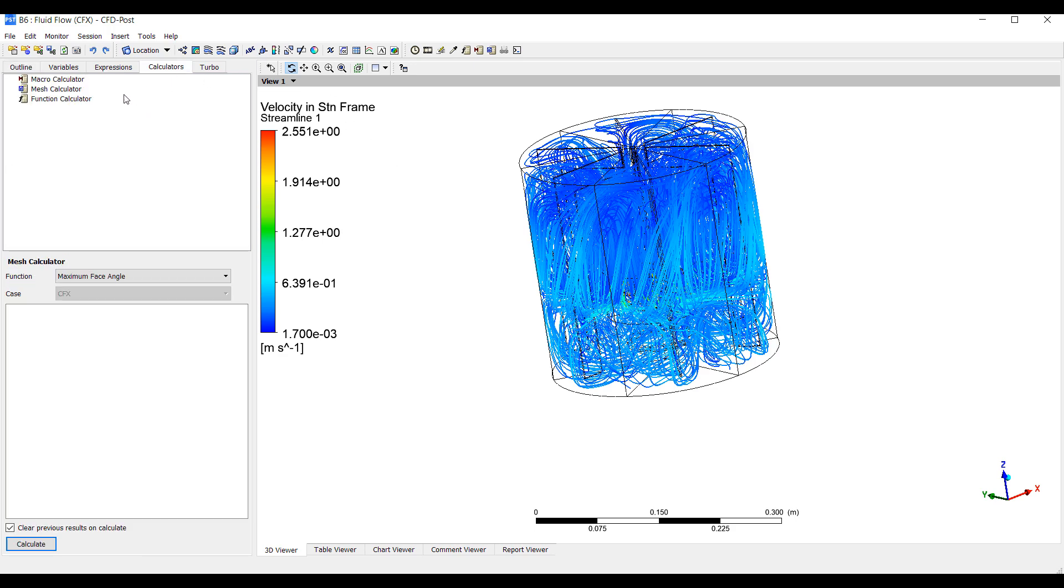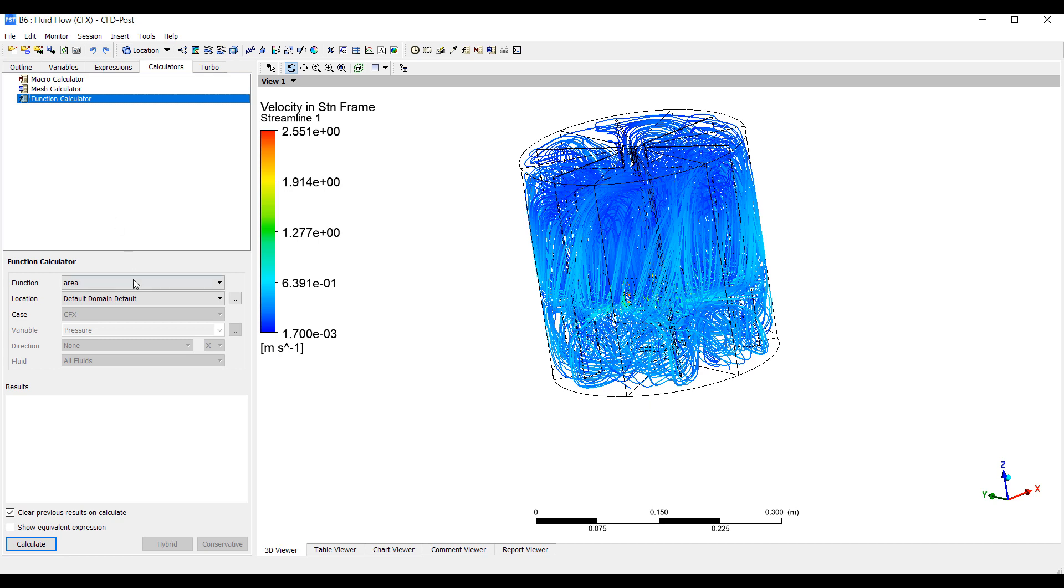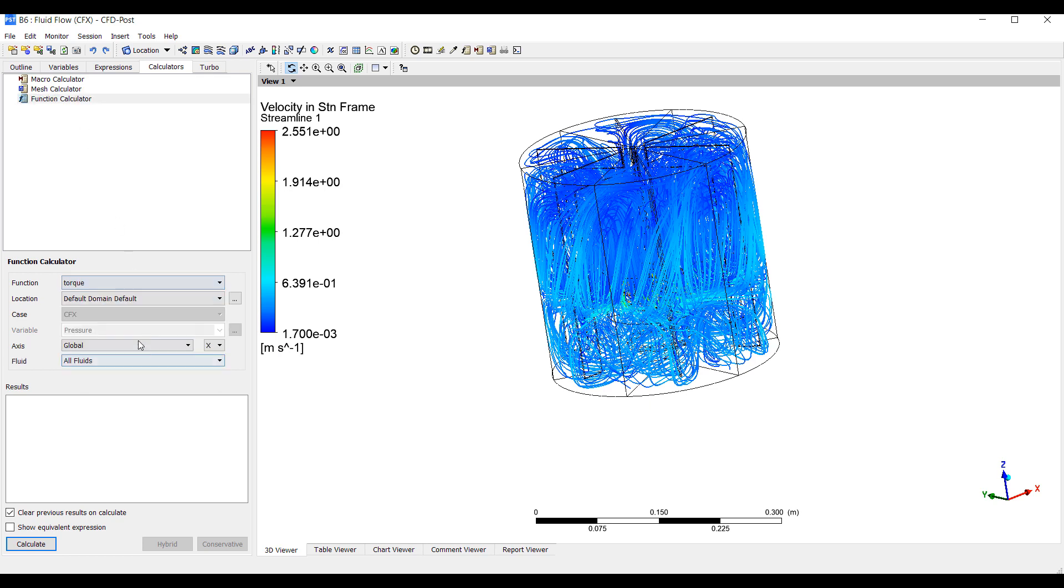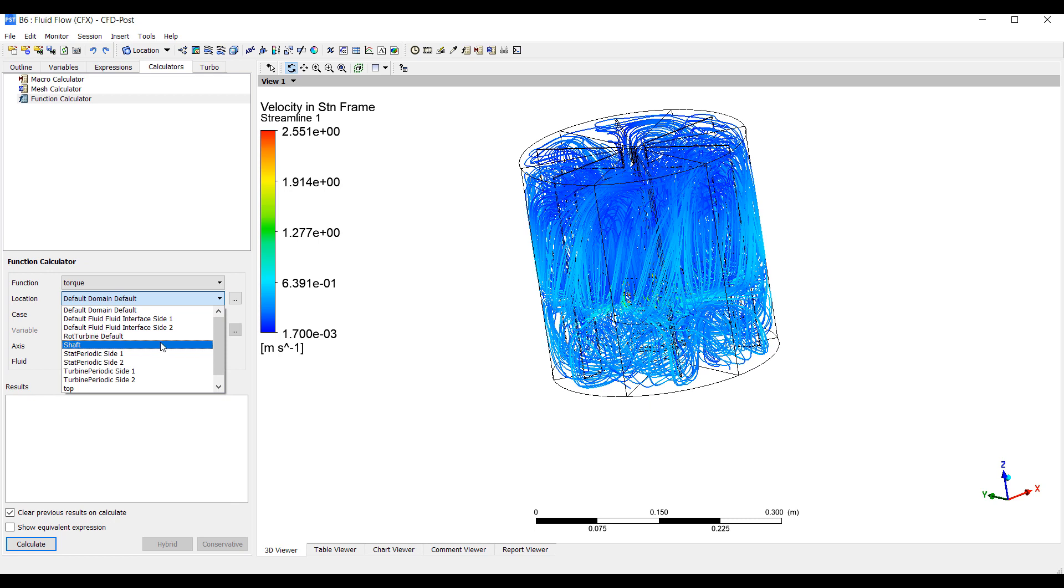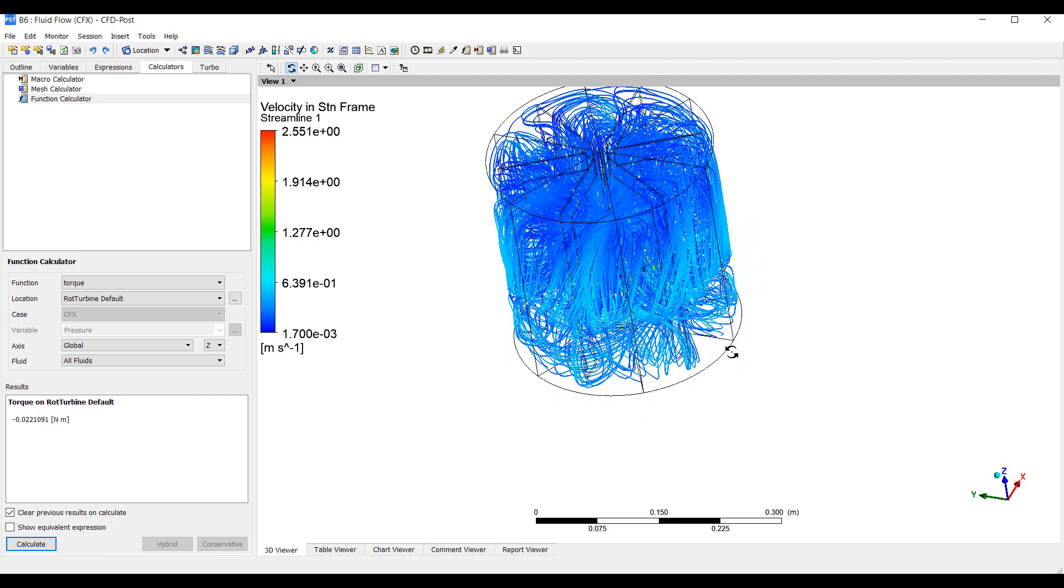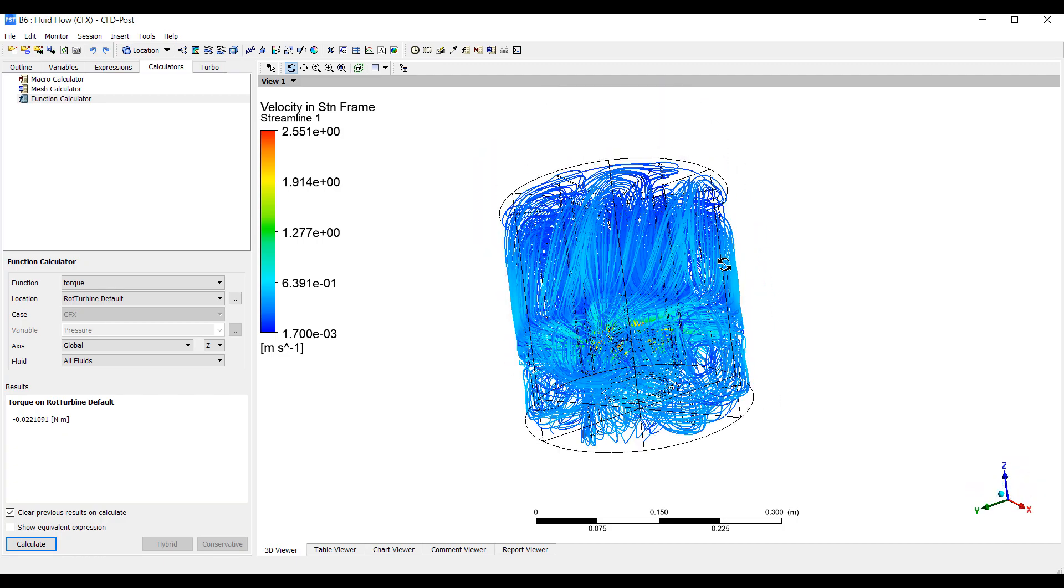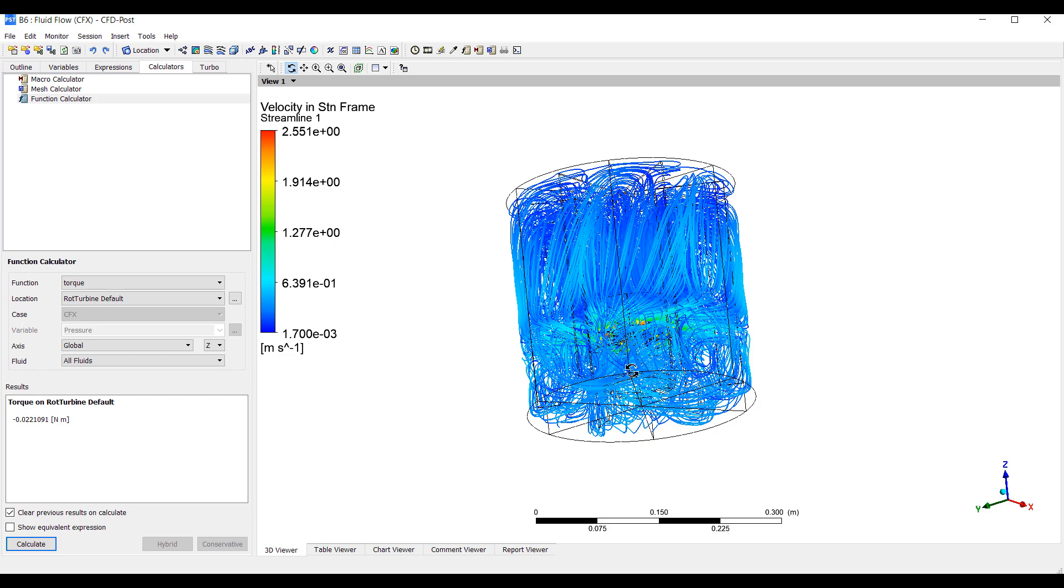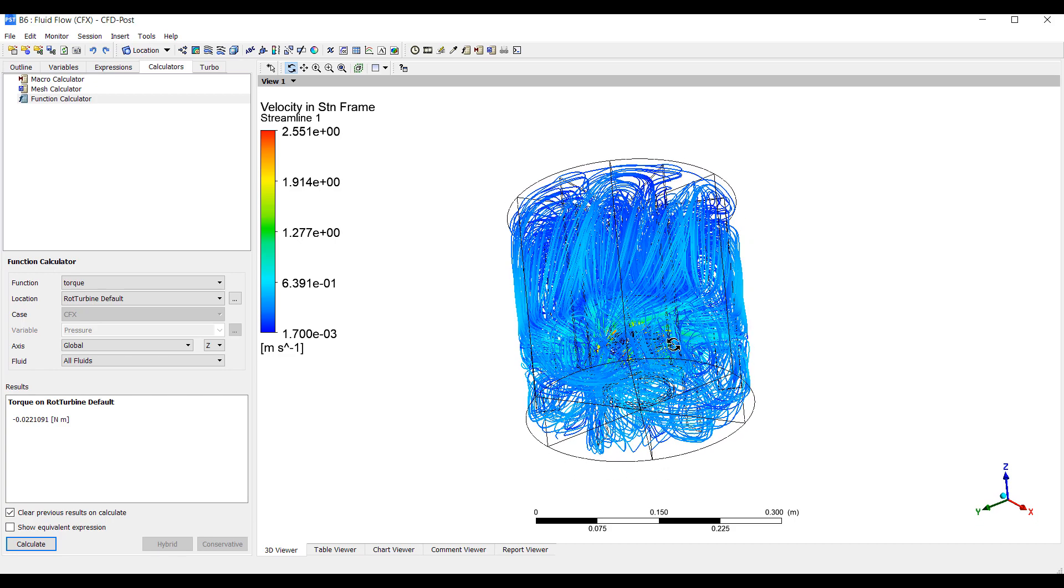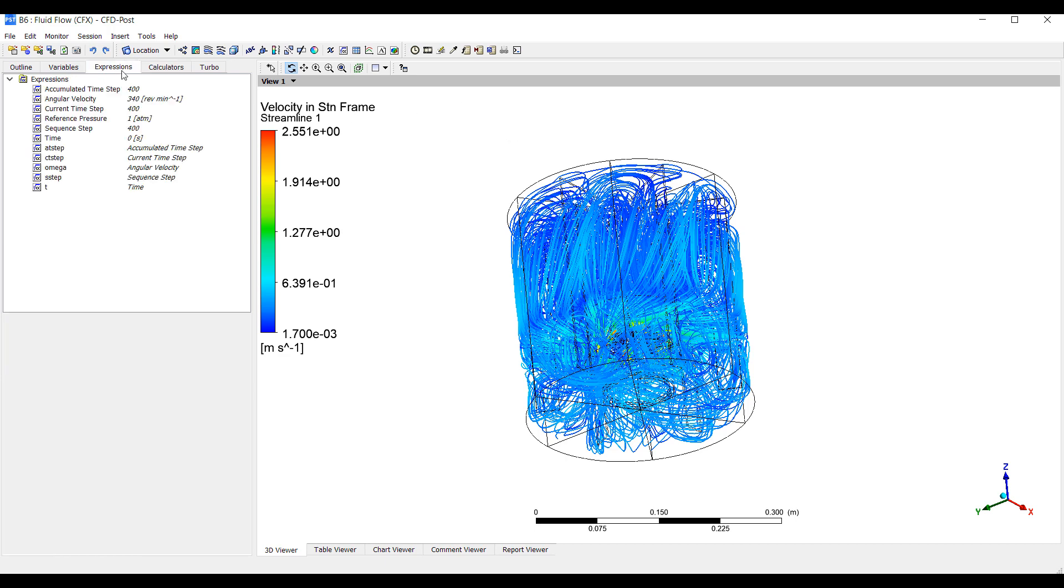So from here we can do a number of things. Let's start to do some calculations. Using a function calculator we can for example calculate the torque on the turbine default, rotational turbine. That's the wall area. And we want the z-axis torque. This tells us how much torque needs to be applied on our rotor in order to turn it at 340 revolutions per minute.